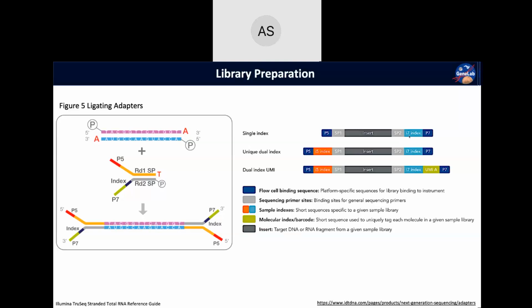However, there are some little tricks and weird things that can go on during sequencing and cluster formation, specifically before sequencing, where these indexes sometimes will hop. So they'll actually hop around and become associated with another cDNA, which could have possibly come from another sample.